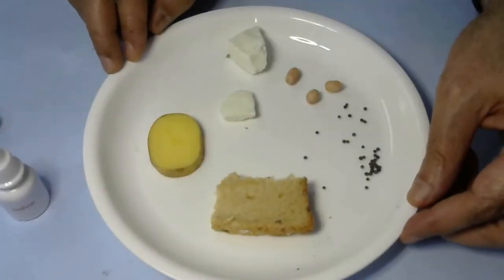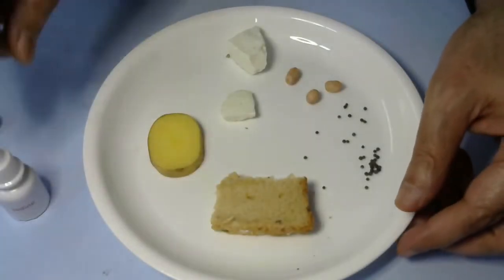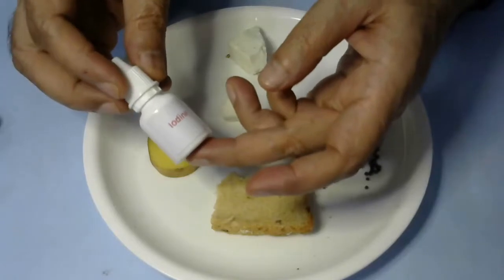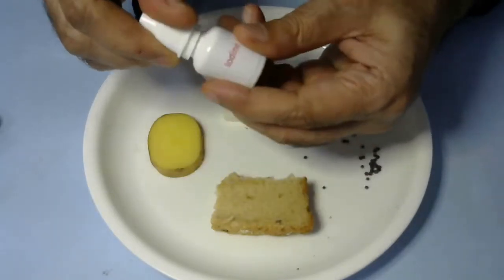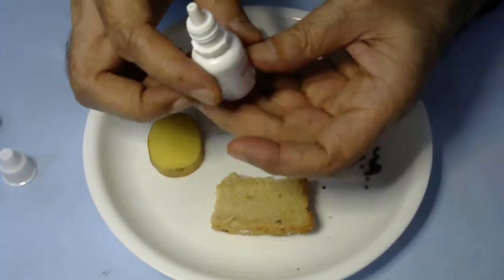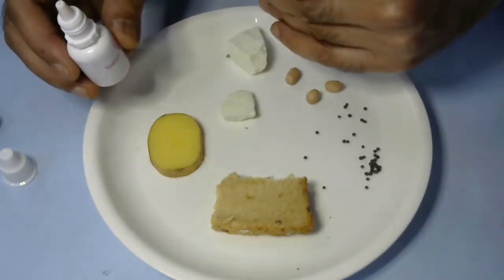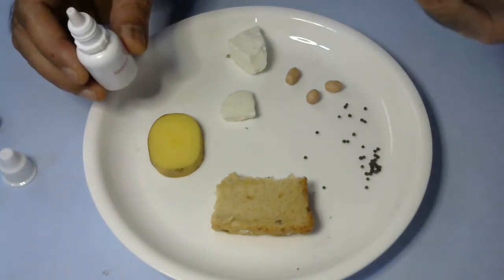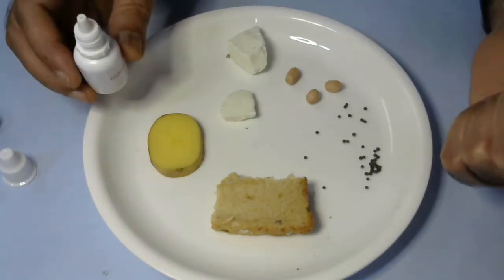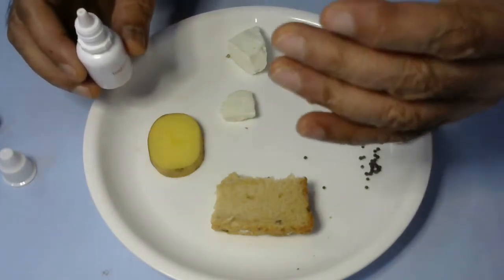Next, we will test starch in our food samples. For testing starch, we'll need iodine solution. Iodine solution is light brown in color. When you put iodine solution on any food sample, if it contains starch, the food sample will turn dark blue or black.